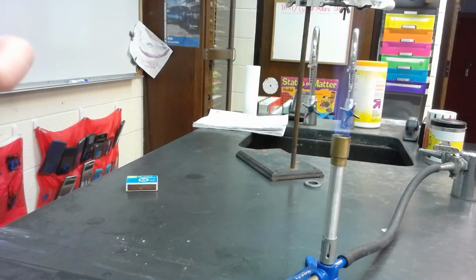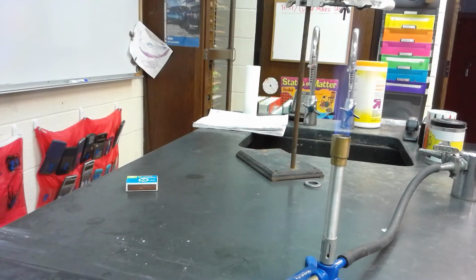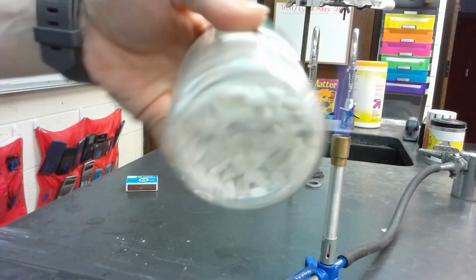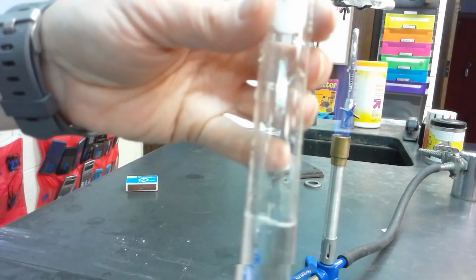So we have, again, the large test tube. We're going to put hydrochloric acid in that, just like we did for the previous reaction. So here's our hydrochloric acid. And then we're going to put a marble chip in it. And marble chips just look like rocks, and that's what they are. They are little pieces of the rock marble. Marble's used as floors and countertops sometimes, but it does react with acid.